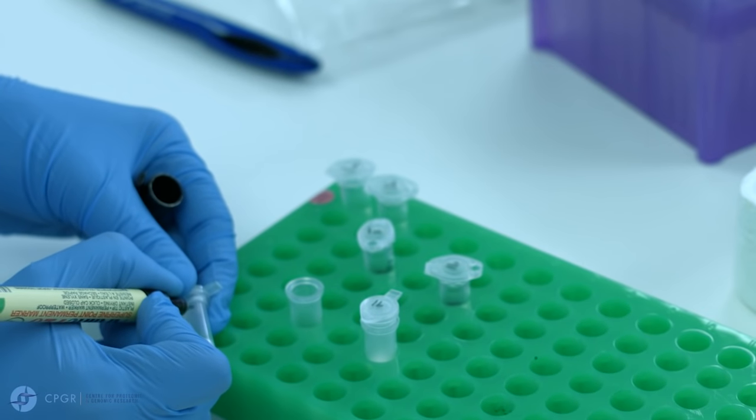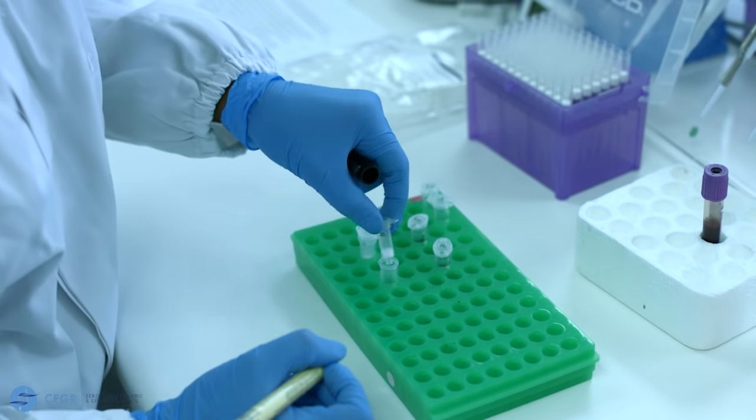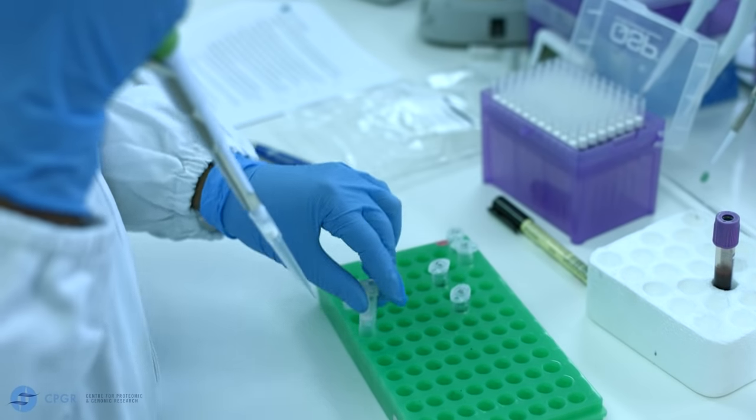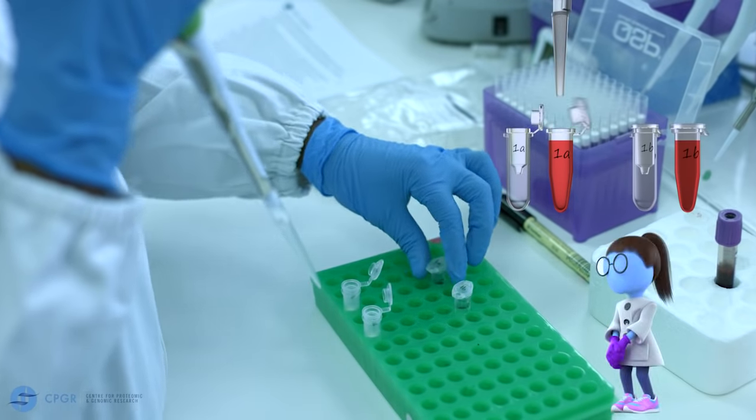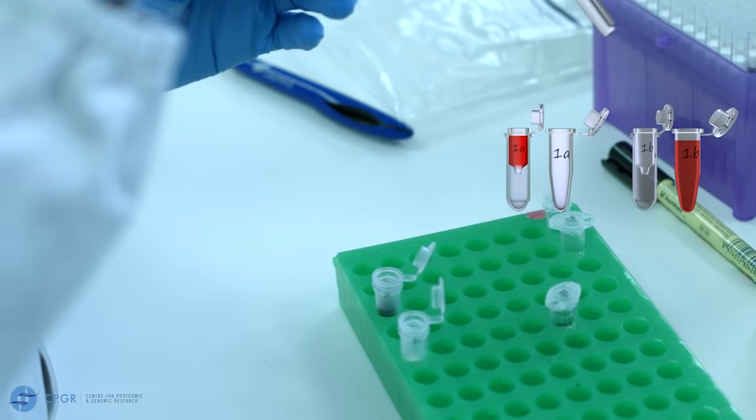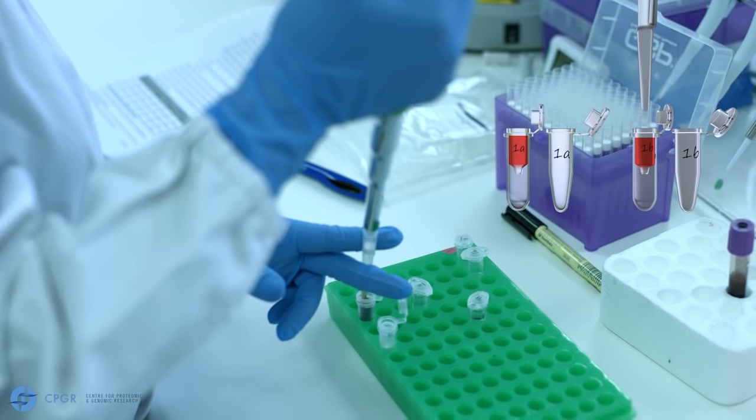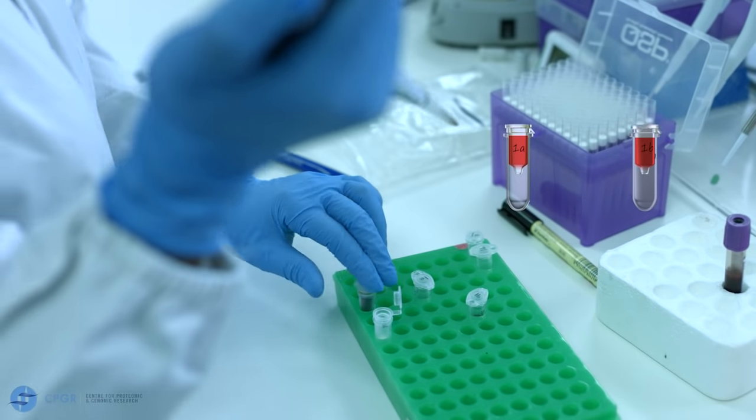We usually label the sides of the spin columns as well in case the ID on the lid is smudged by ethanol. Carefully transfer the mixture from the previous step to the spin column, taking care not to wet the rim of the spin column. And this is repeated with all subsequent samples.